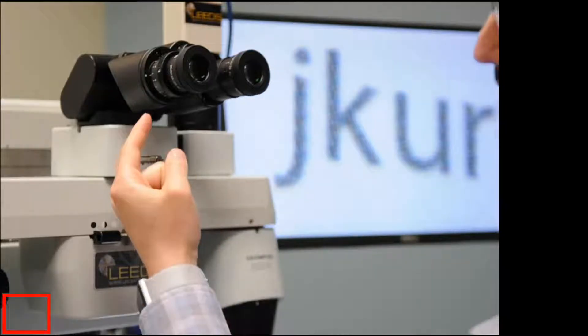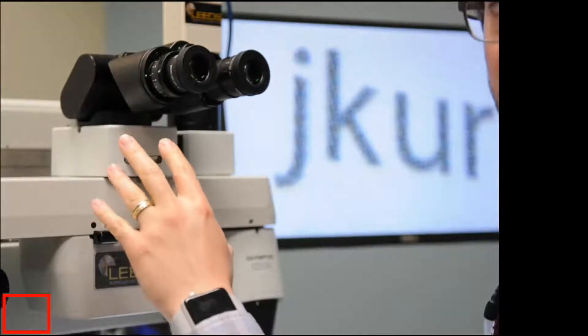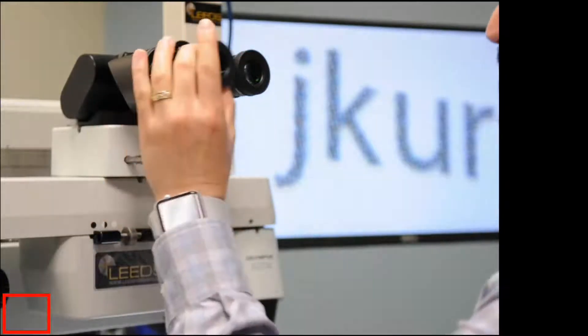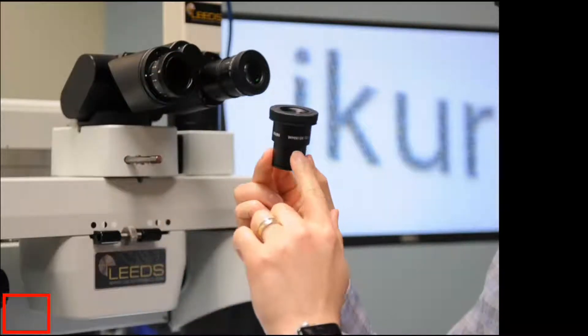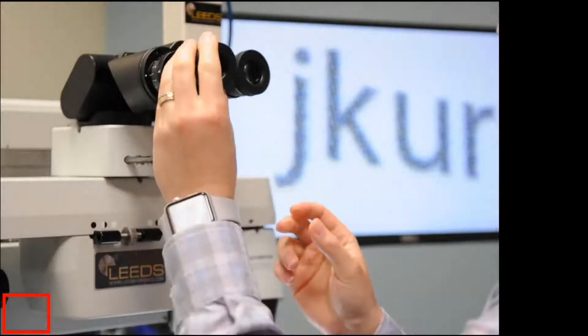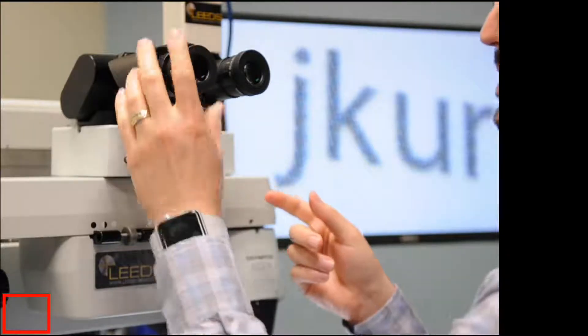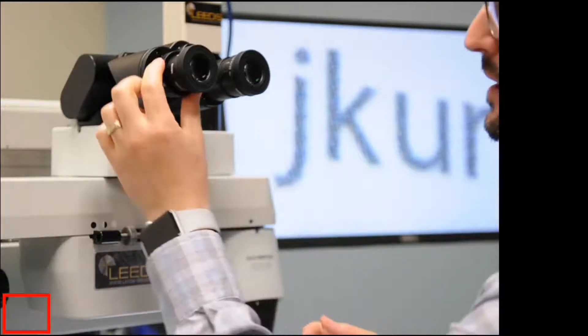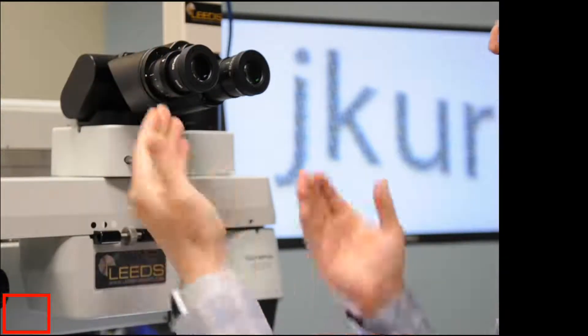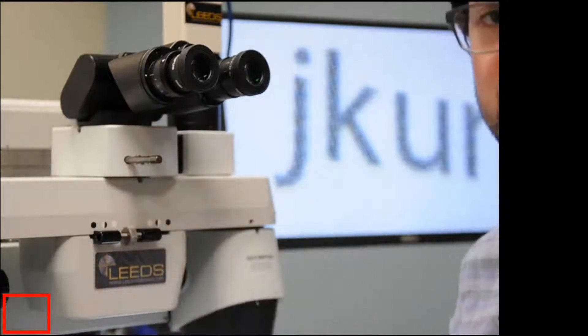So I'm going to go ahead and screw that out. The eyepiece on the left side of this binocular doesn't, you can pull the eyepiece out, but it doesn't have the focus adjustment directly on the eyepiece. So on this style of binocular, what I'm going to do is simply adjust it so it's all the way out, so they're the same.